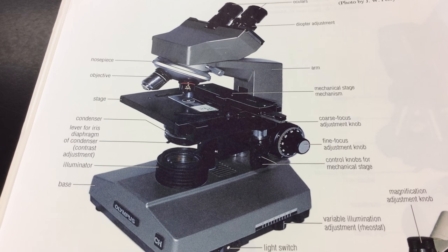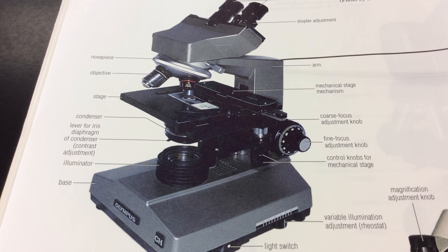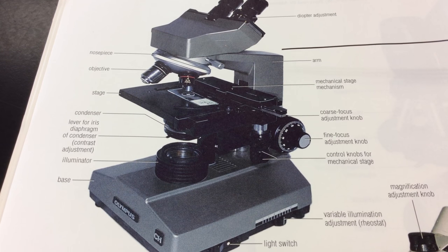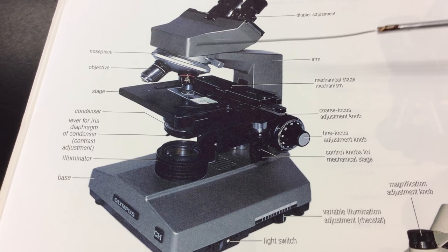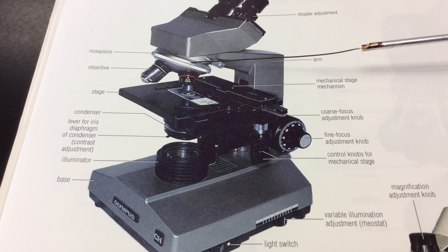Okay, now if we move on down the arm here, we see the arm. We'll be grasping the arm to help move our microscope from one place to the other. And then we'll move over this way, and we'll see here is what's called a rotating nose piece, or sometimes it's called a turret.